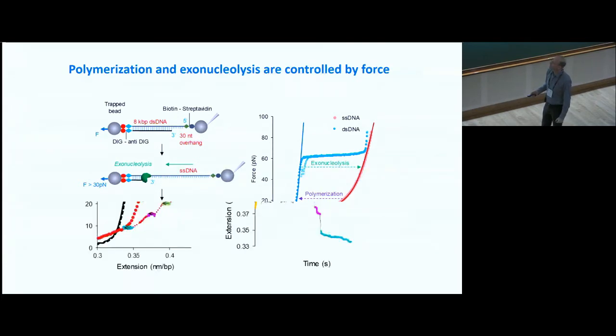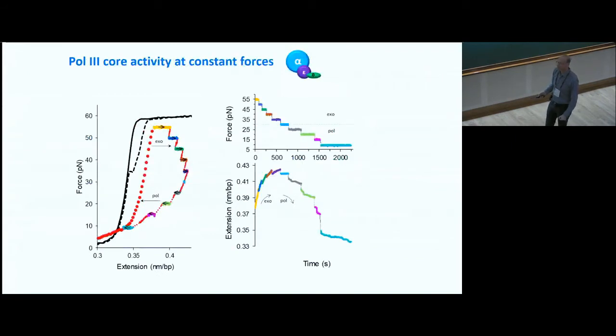And so that's kind of similar to our experiment, except we have these 3 proteins. There's a 3 protein complex, and they're actually all separate proteins. And one of them is alpha, one of them is epsilon, and one of them is called theta. And it doesn't really do much except hold the other 2 together that we know of. And so, these are experiments that we did.